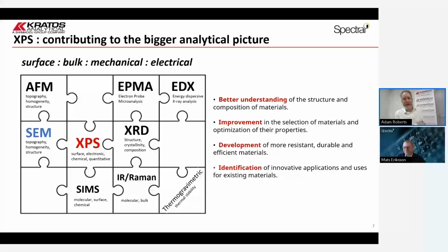I was just going to start by putting XPS in a bit of context for surface analysis and more generally materials characterization. Often we want to determine the surface, the bulk, the mechanical and the electrical properties of a material for a particular application. And as Mats rightly said, no one analytical technique is really going to give us all those answers.